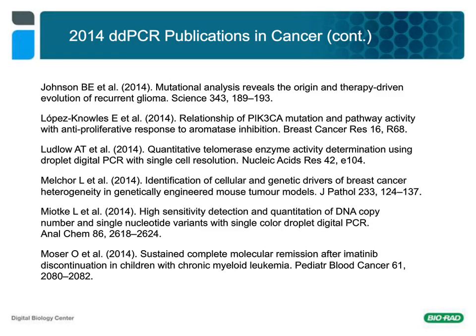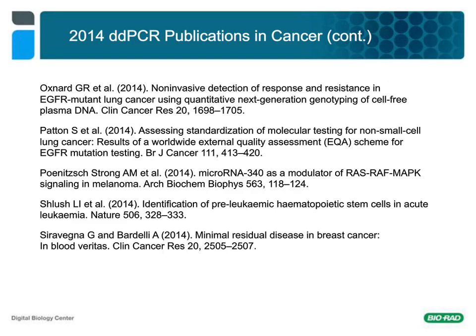If I understand it correctly, the assay is only applicable to detect known mutations. Is this correct? Like other PCR-based methods, digital PCR is based on knowing what your sequence is and what your mutation is.